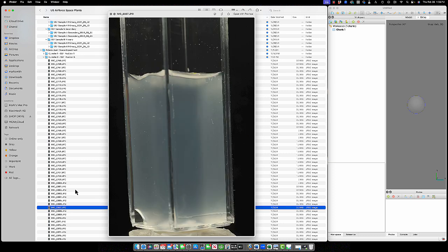So what we're going to try and do is 3D model these without any editing. We're going to pull all the data in, do a batch process, and see what we get. If we see that it's not effective, then we'll go into Photoshop, perform a mass edit and apply it to the rest of the images in the data, and run it that way.